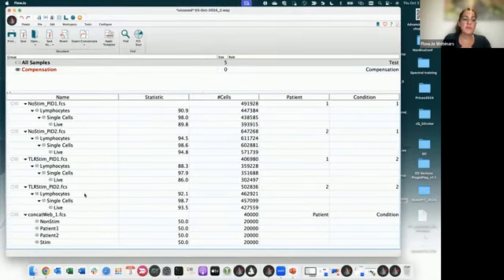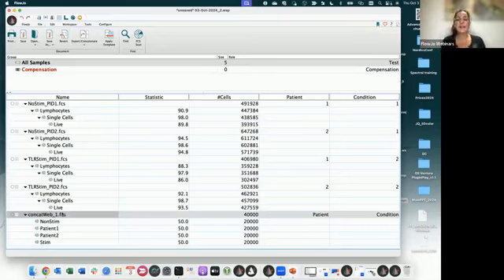And so then you can proceed with your analysis, you can do a t-SNE and so on, and then you can backgate each individual condition or patient to that t-SNE plot, UMAP plot, and so on. So that's how you go on whenever you want to compare different conditions, different treatments, and so on.